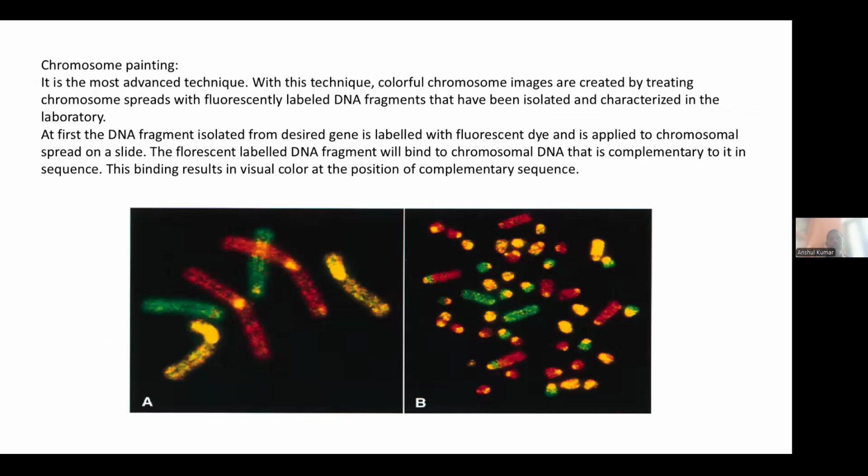Then next is chromosomal painting. It is the most advanced technique. With this technique, colorful chromosome images are created by treating chromosome spreads with fluorescently labeled DNA fragments that have been isolated and characterized in the laboratory.